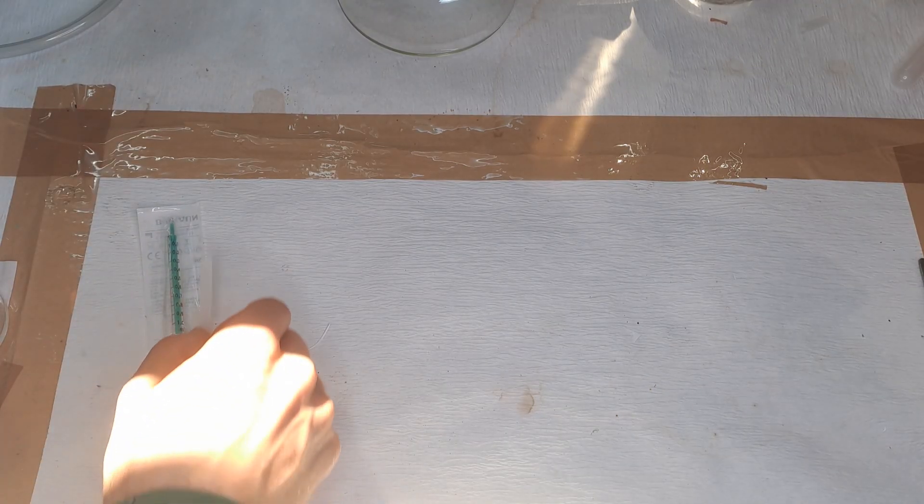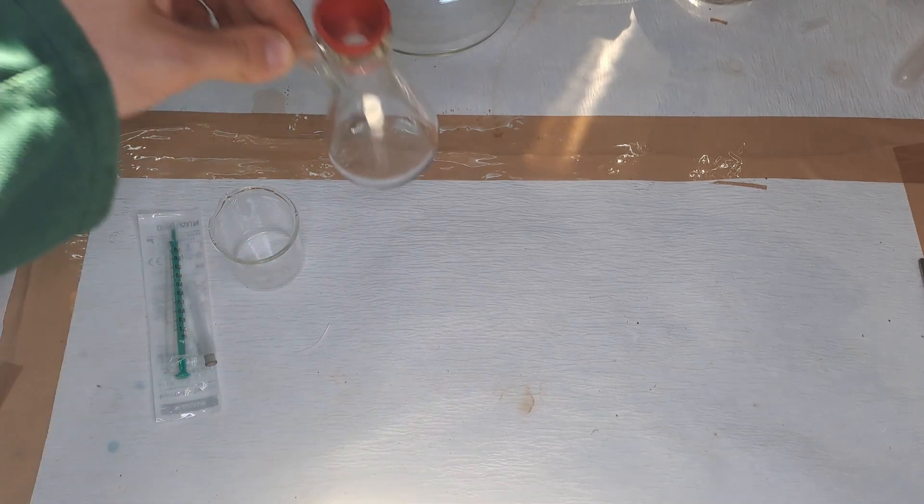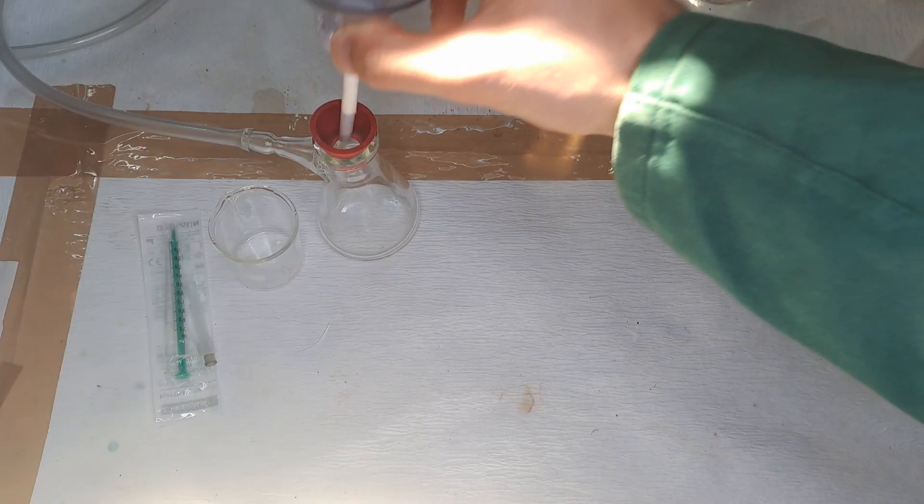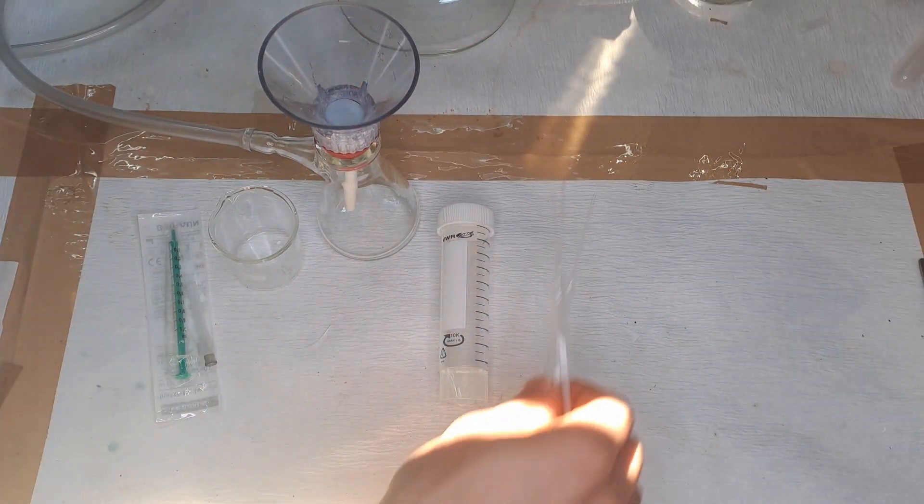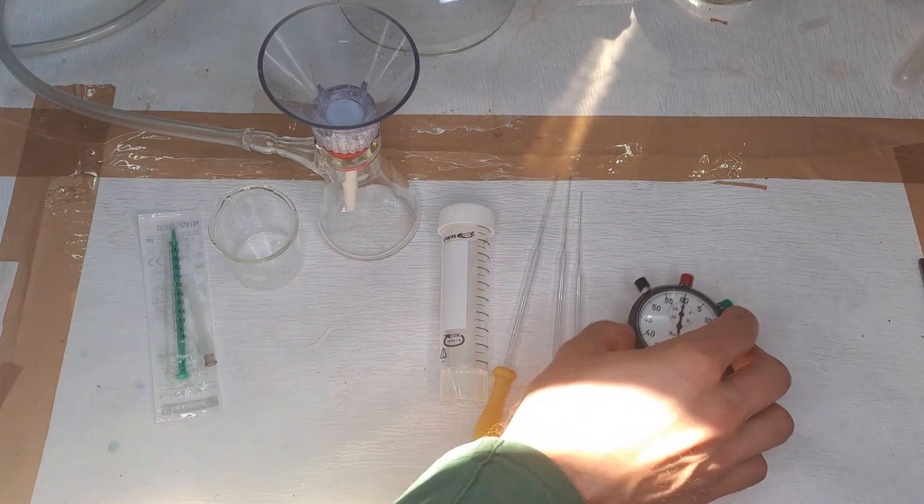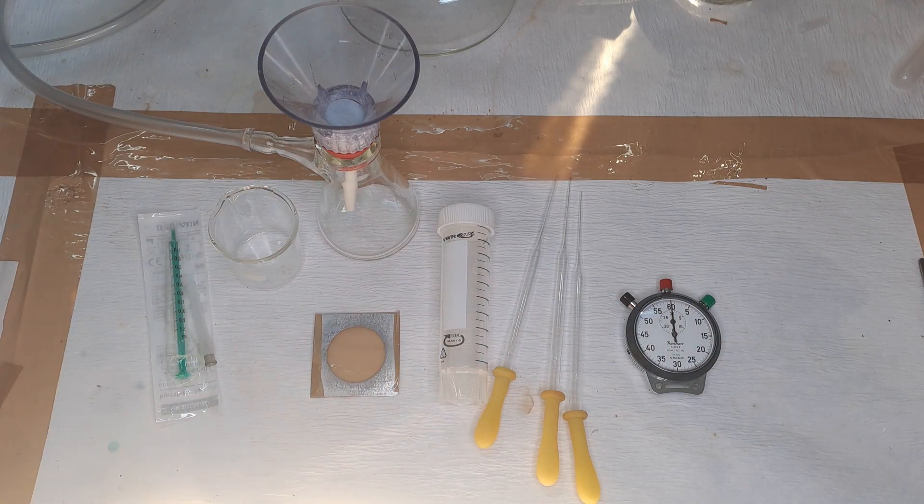Equipment needed: a syringe, a beaker, a Buchner funnel with a filter, a falcon tube for the stock solution, three pipettes, a stopwatch, a metal frame with tape, and a Geiger-Müller counter.